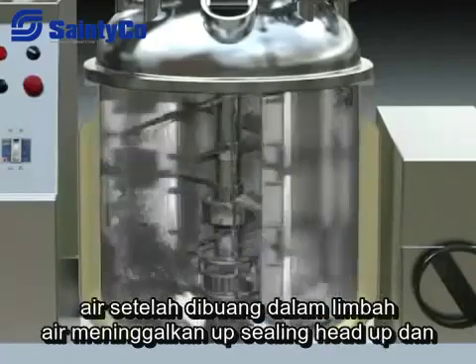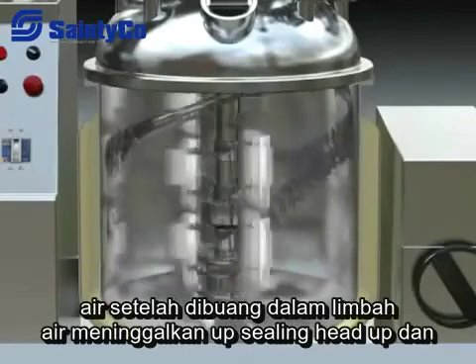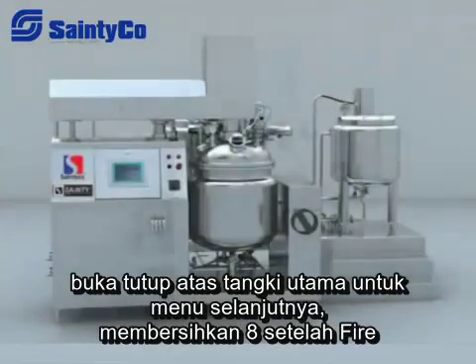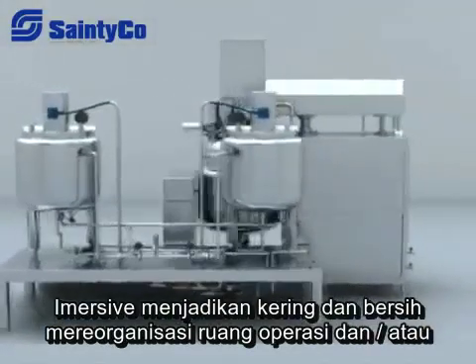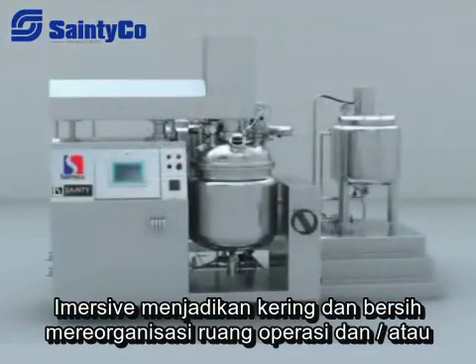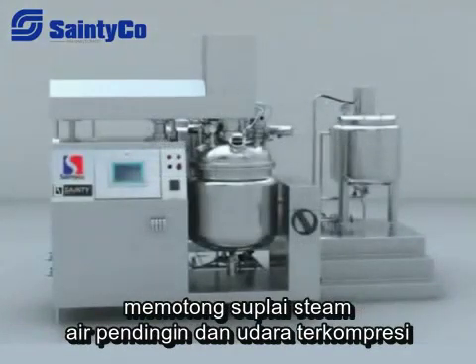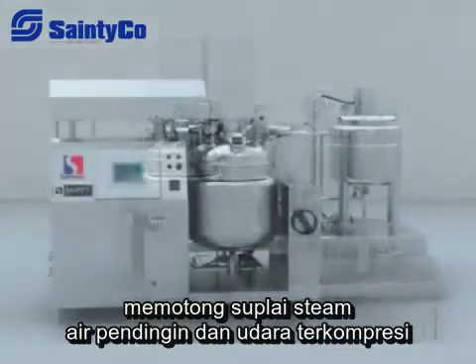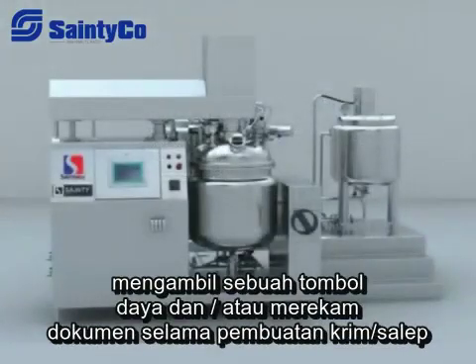After discharging the waste water, lift the upper sealing head and open the upper lid of the main tank for manual cleaning. Make all spots dry and clean, and reorganize the operation room and all appliances. Cut off the general power supply, steam, cooling water, and compressed air. Take out the power key and all record documents from during manufacturing.